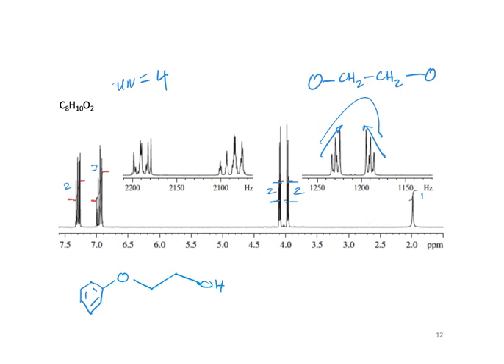Oh, because at 2 ppm ish. Well, alcohols can move around a lot too. Yes. Right. But because it's just kind of a semi-broad signal with no splitting or anything, usually OHs don't show up splitting either because they can hydrogen bond and they exchange.